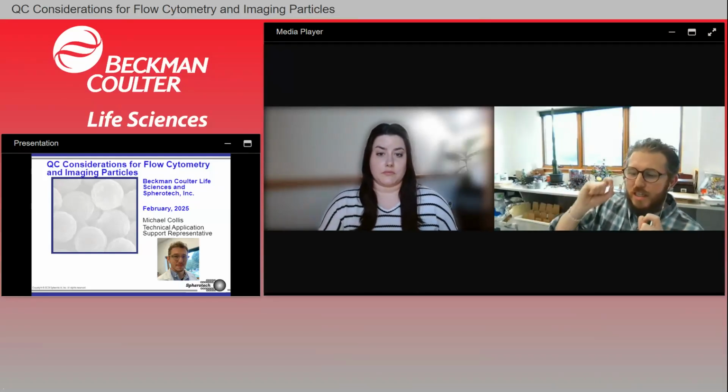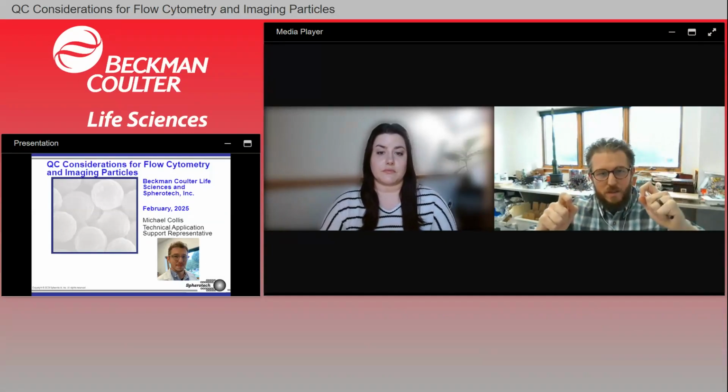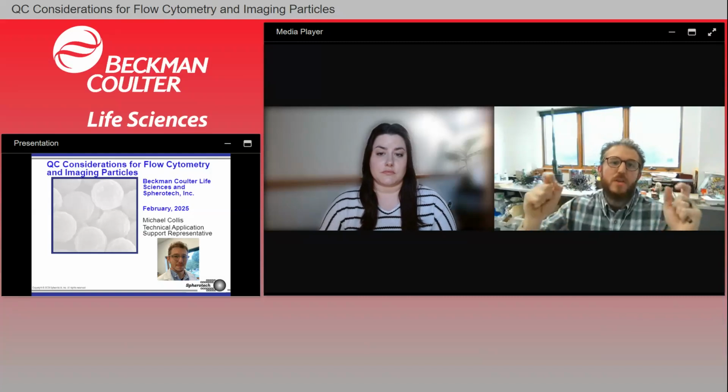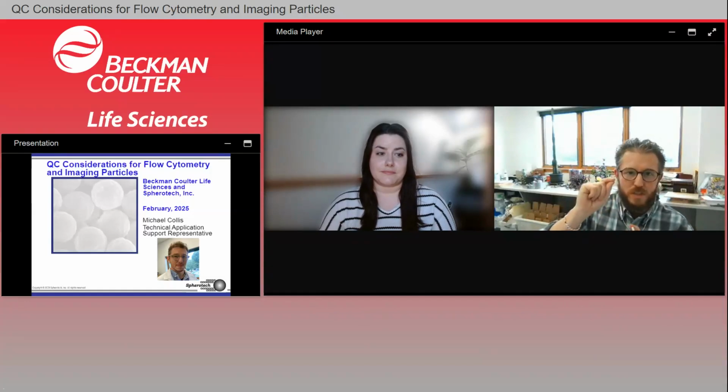So they're saying literally when they take our particle and test it against this known quantitative dye in a fluorimeter, they're coming up with this ERF value. I do have some literature for this, but I think the question points to something that's very profound.